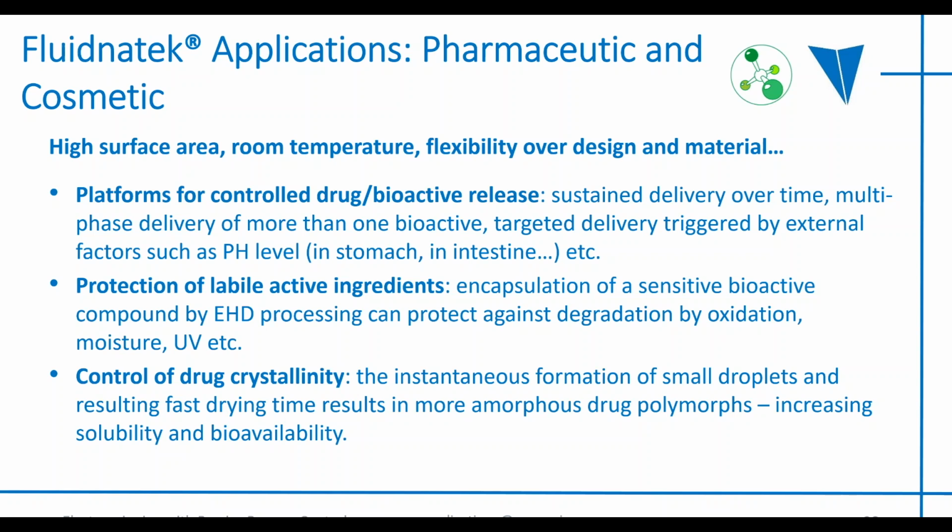It's also used for the protection of degradable materials, so to protect them from oxidation and give a longer shelf life, you can encapsulate them using this electrospinning and electrospraying process.